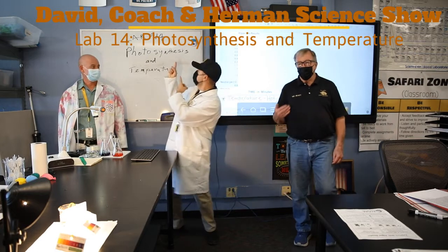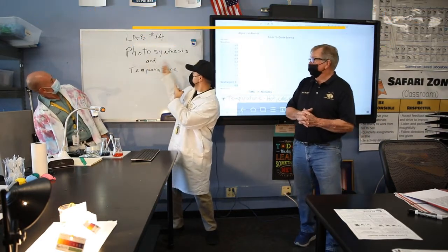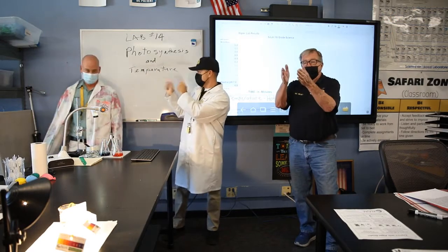Today we're having another lab with the algae. It's going to be lab number 14, photosynthesis and temperature. So you're going to take your little capsules and put them in different temperature water. Don't put it in boiling water because the little guy's going to burn up. But put them in ice water, room temperature water, and warm, like out of the faucet, warm water, okay? And we're going to see which one helps photosynthesis or not.